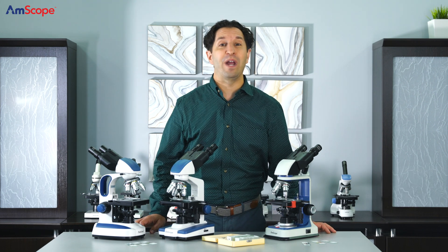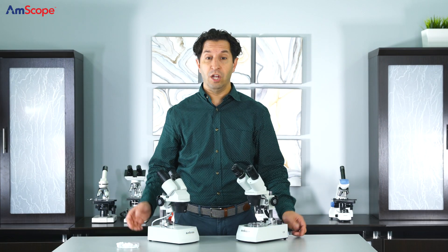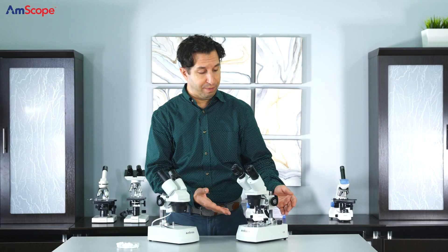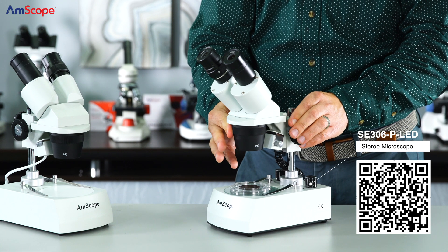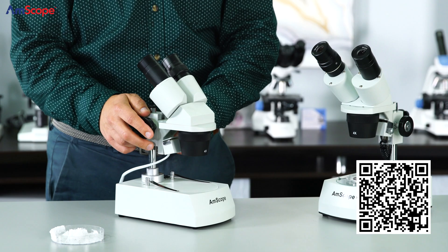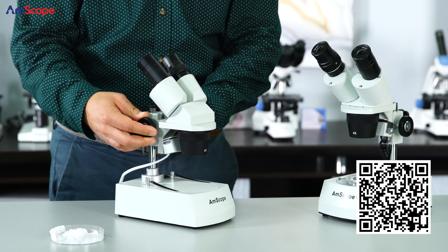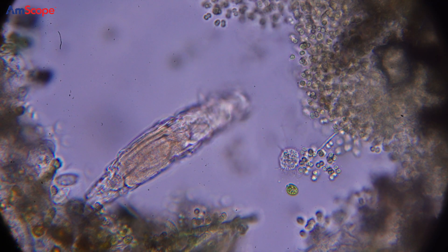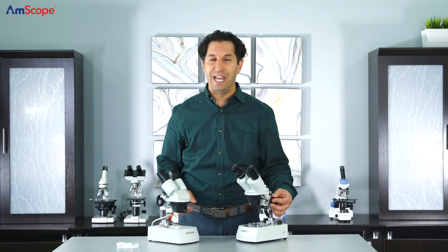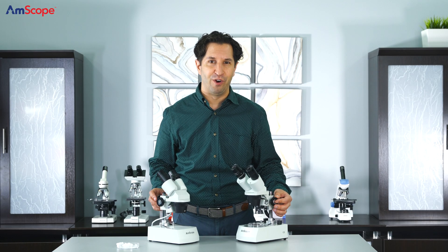Students can observe this phenomenon by preparing leaf disks and measuring the rate and effects while using the microscope. Maybe your classroom contains the next great botanist. What about collecting and culturing bacteria from around the school in petri dishes? Headlining our stereo line, these fixed microscopes are suitable for middle school and high school labs alike. Students will be amazed as they watch the microbes move around — there's literally life all around us and your students will be thrilled to discover it.